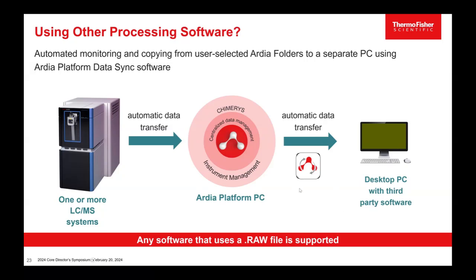But we do have another tool called the Ardia Platform Data Sync that you can install on any desktop PC where you want to do data analysis. And once you install that, you can target a folder, or multiple folders, on the Ardia platform server, and it'll download all the raw files from that folder to your desktop PC.